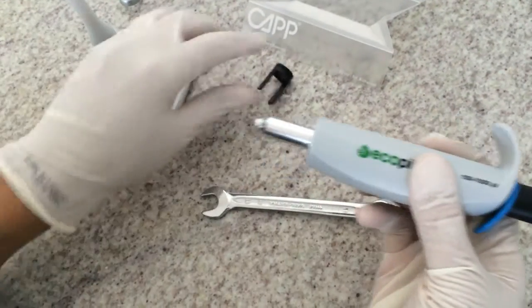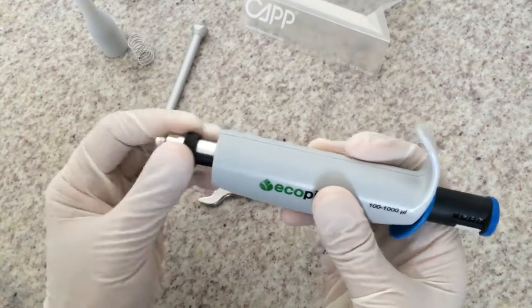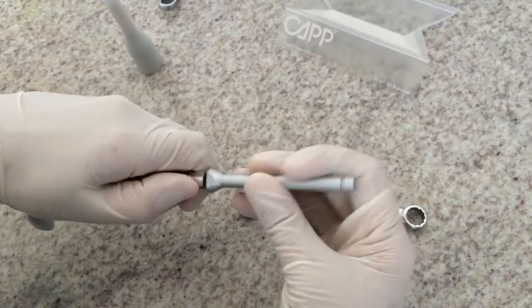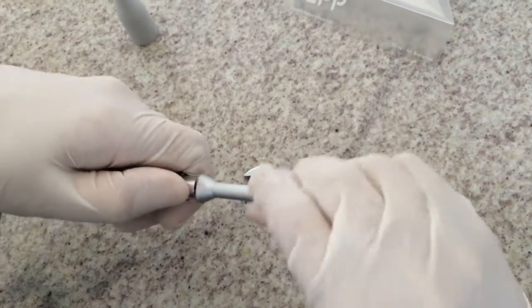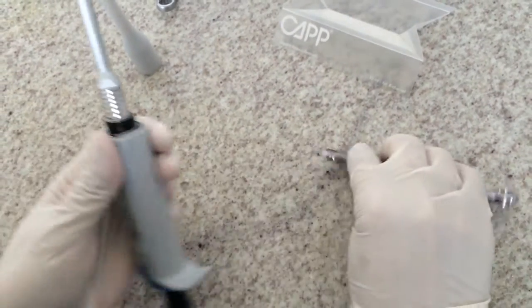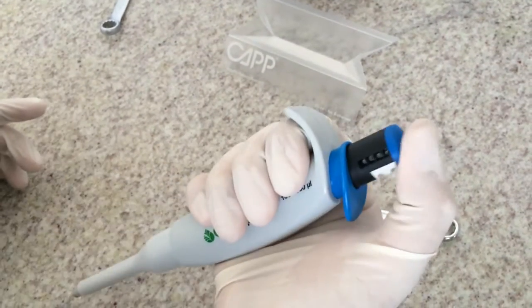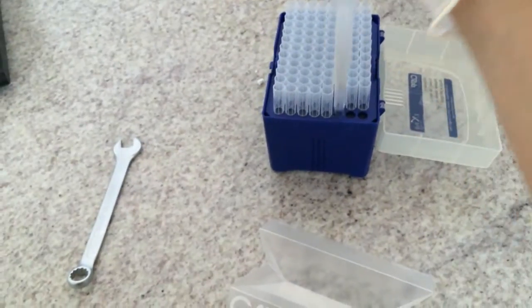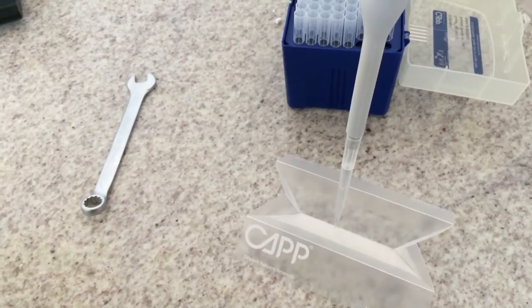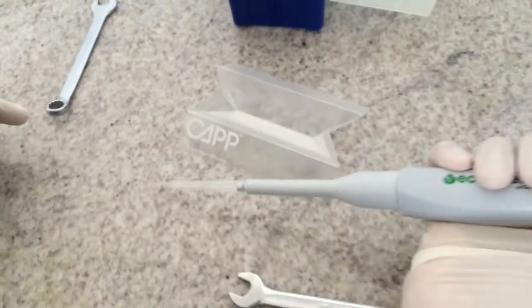Then you can conclude the assembly procedure by mounting the final parts. You have now completed the troubleshooting of this pipette.